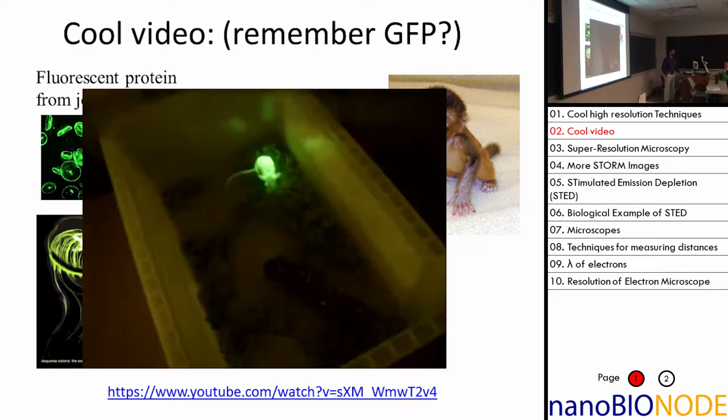Are they shining any light on it, or is it just dark? No, they're shining light, because the thing is green fluorescent protein, so you have to shine light, and then it will emit green. It's probably UV light they're shining at it, so you don't see that per se. How did they get the fluorescent blue? Change it from green to blue in the video? I don't actually know.